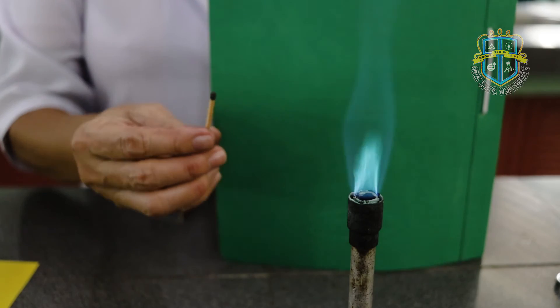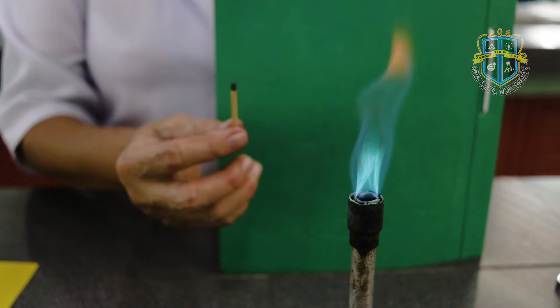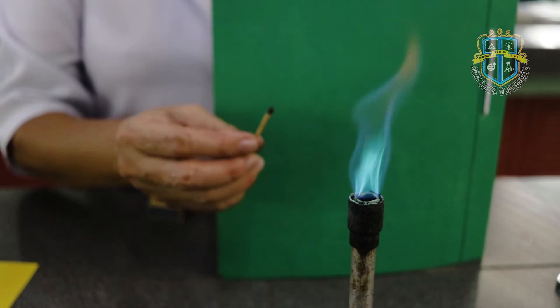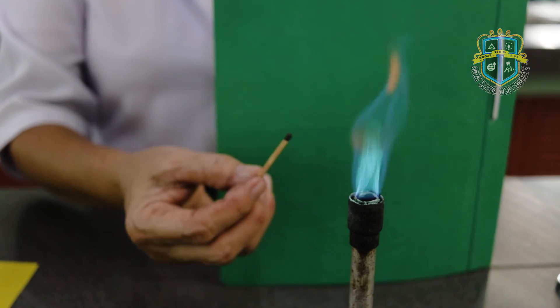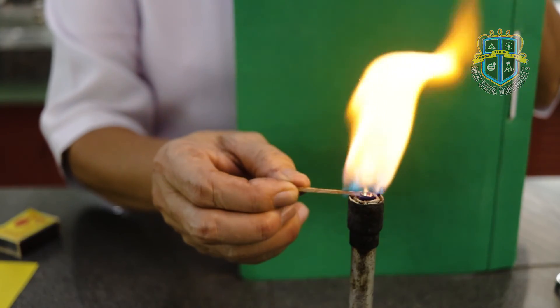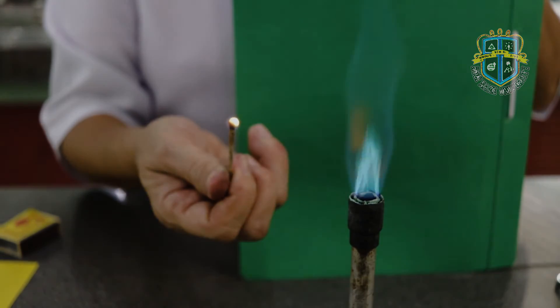Then, insert the head of the matchstick onto the top of the barrel with this kind of flame and observe. For the last part of this experiment, insert this glass tubing onto the top of the barrel at some angles, then ignite the other end of the glass tubing and observe what happens.